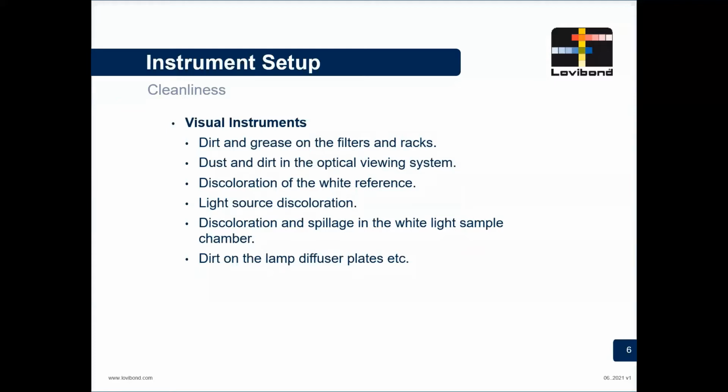We could be making the colour match with the glass and any dirt or grease or oil that's actually on the coloured filters. So we need to keep them clean so that we actually get a proper colour match, so that the colour match is the colour match that we're expecting, not one due to dirt or discoloration.